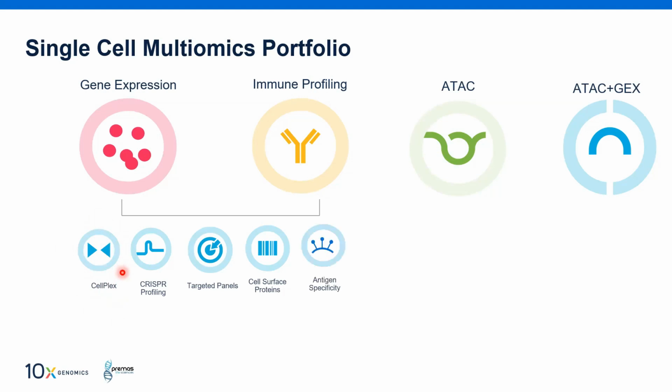Then coming to antigen specificity, which is a very important aspect of any T cell. My TCR sequence, or this T cell, is binding to which antigen? This is feasible through another company, Immudex, that provides the reagents of class 1, class 2 presented antigens, MHC presented antigens, the Dextramer technology. Once you incubate this with the T cell population, we come to know which TCRs are binding to our specific antigens.